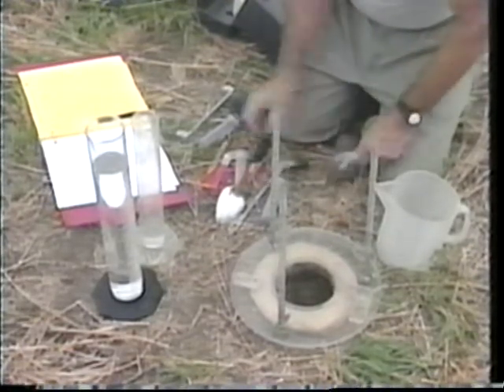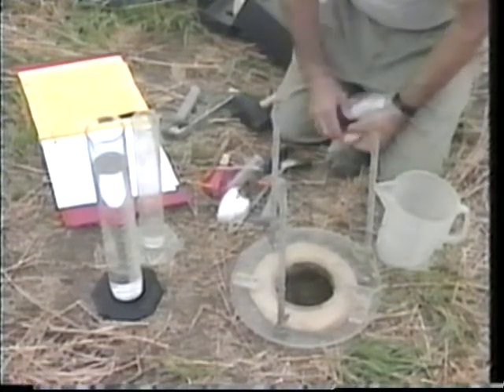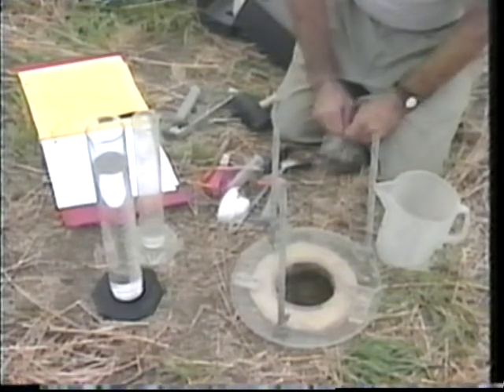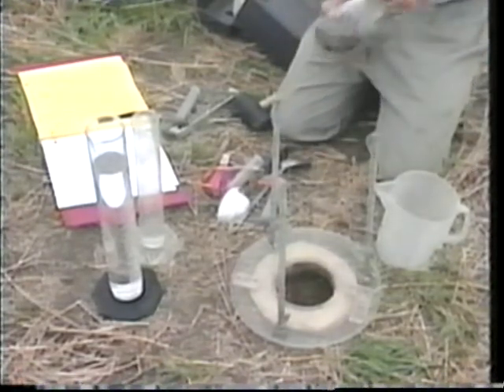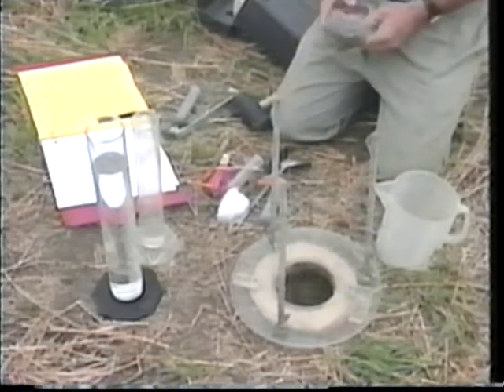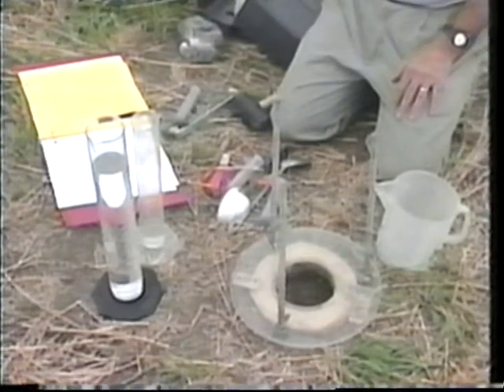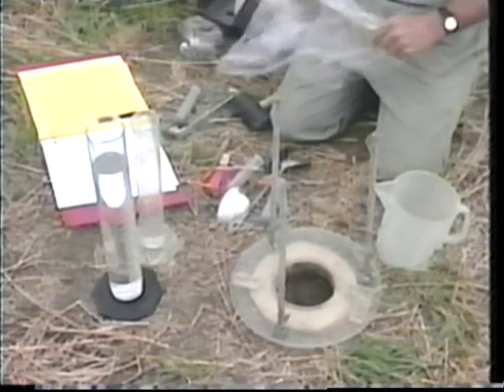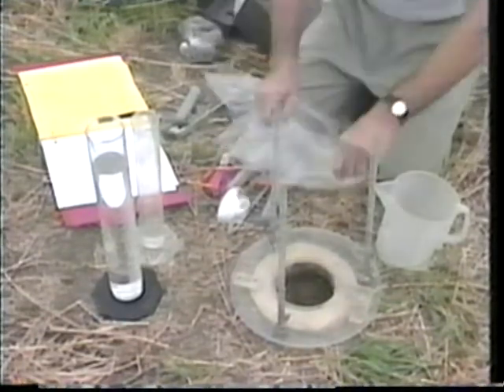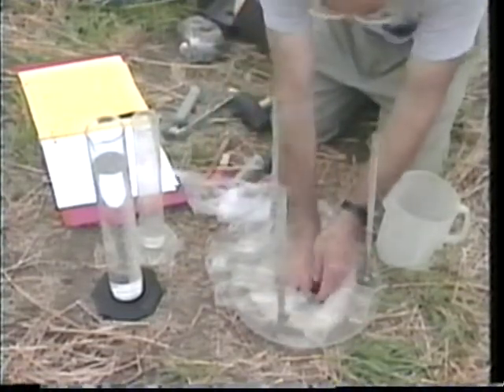Ordinarily we would take this back to the office and oven-dry it. We'd make a correction for rock fragments if there were any, and then we'd have the weight. To get the volume for the bulk density — which is the ratio of the oven-dry weight to the volume — we make a second measurement of that volume, the same way as for the first.